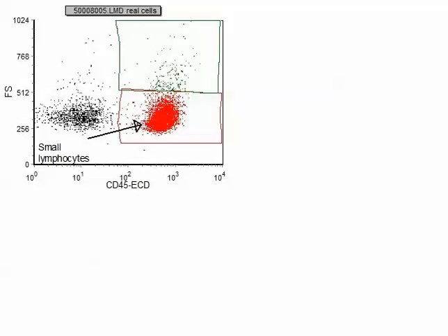So here we have an example of immunophenotyping of follicular lymphoma, if I'm not mistaken. And this is the second most common NHL and most common of the slow-growing lymphomas. It is the 14;18 translocation with rearrangement of the BCL2 gene. This translocation brings about inhibition of apoptosis by BCL2. So remember, follicular lymphoma: 14;18 and the BCL2 translocation.